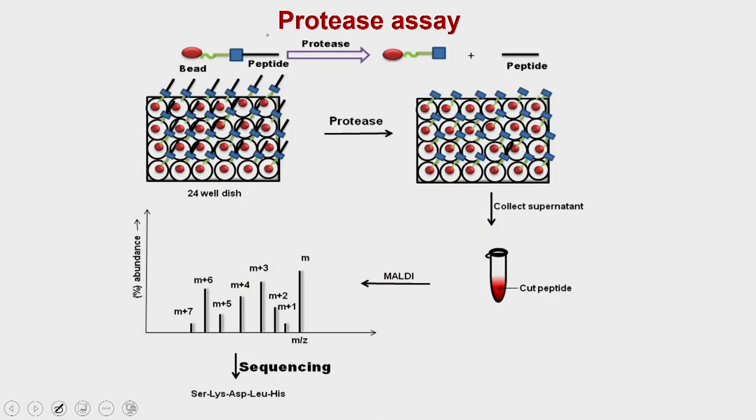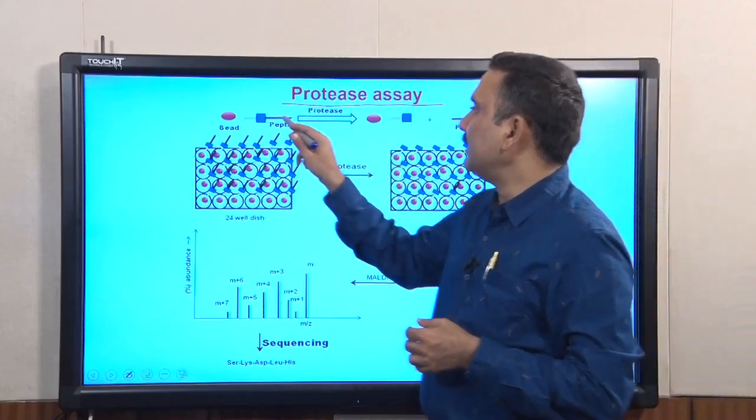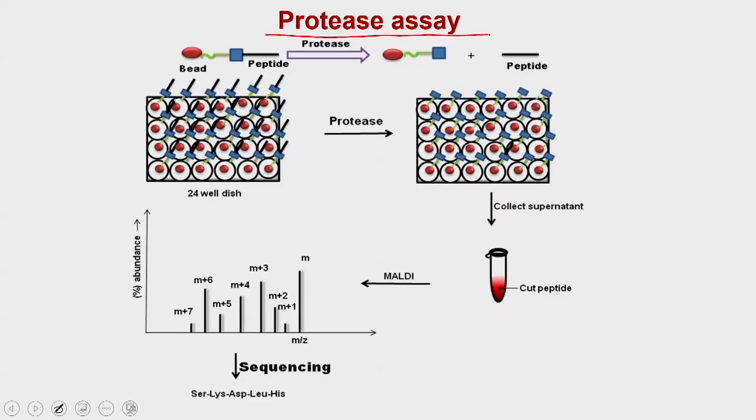In an alternate experiment, you can use affinity chromatography to design a protease assay. In a typical protease assay, you are going to have a peptide, then you put an affinity tag onto this peptide, and then you use the affinity beads. This is going to be your sample.